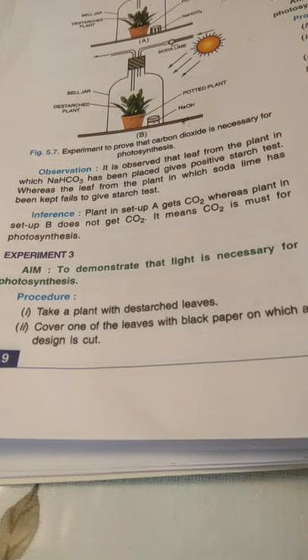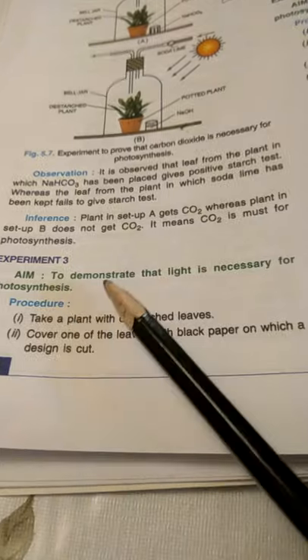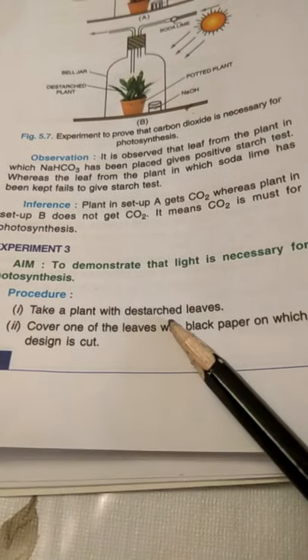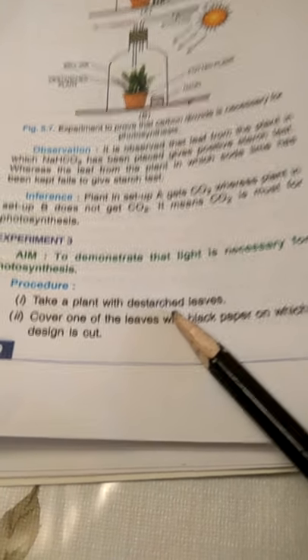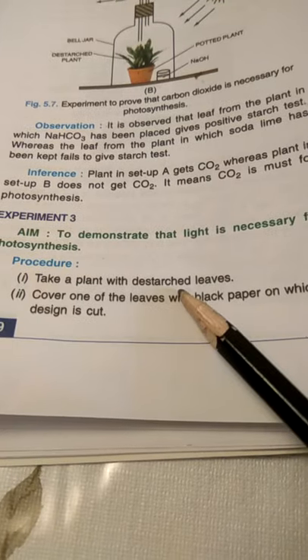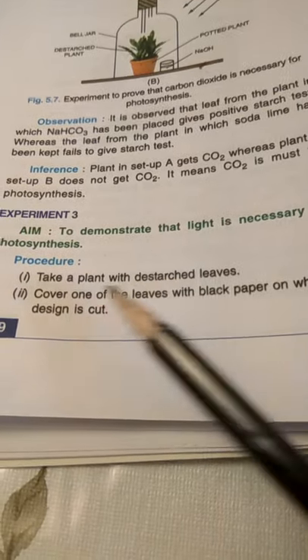Good morning children. I will be taking the third experiment today to demonstrate that light is necessary for photosynthesis. We'll take a potted plant and put it in the dark room for at least 48 hours to destarch the leaves of the plant.